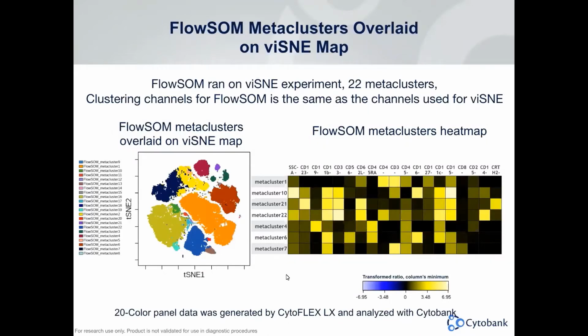Another way to visualize the same data is to use a heat map. You can view the metaclusters of each channel on this heat map. So for our next session, Stephanie will show you the FlowSOM clustering algorithm next.